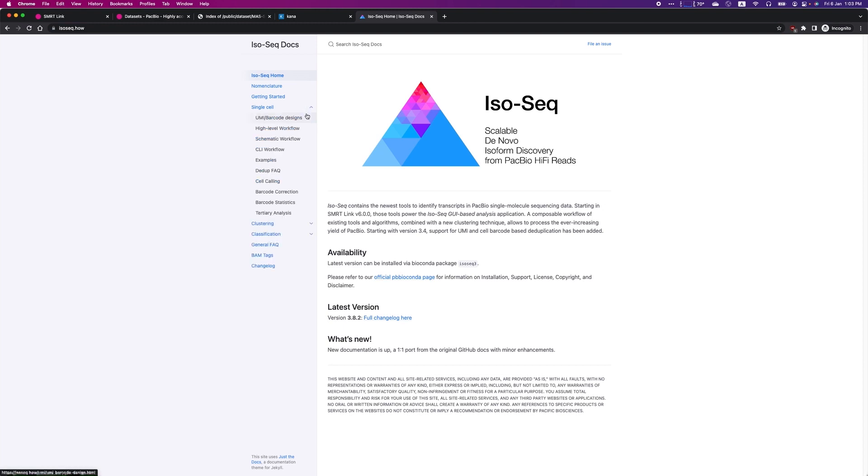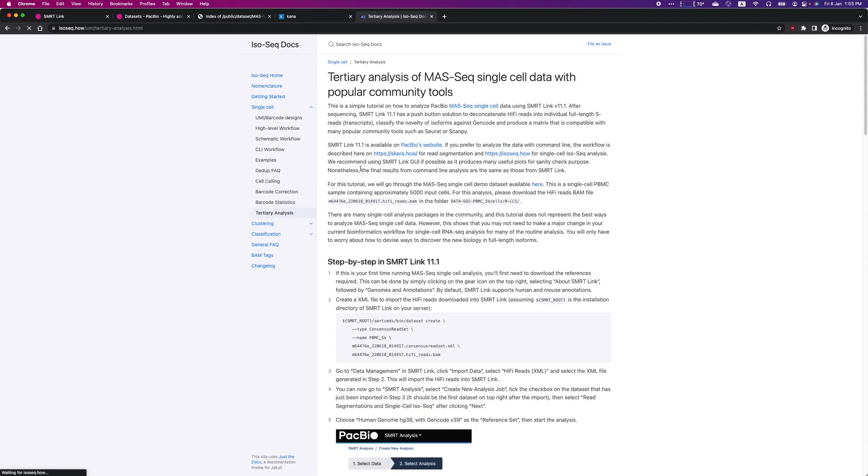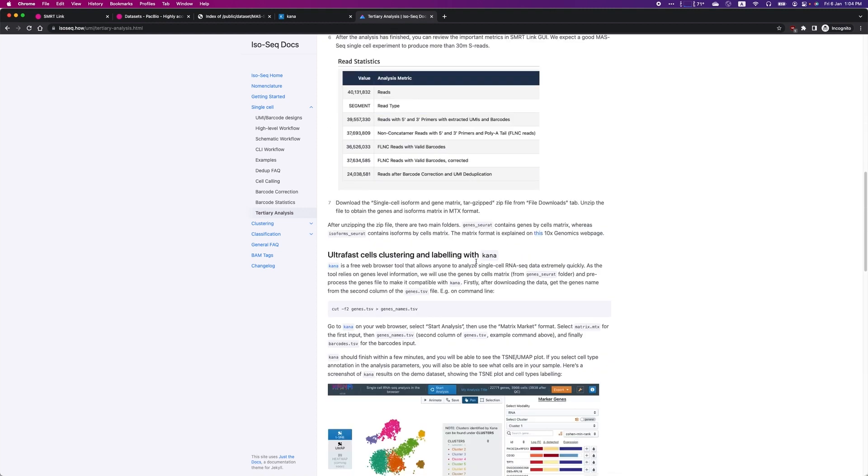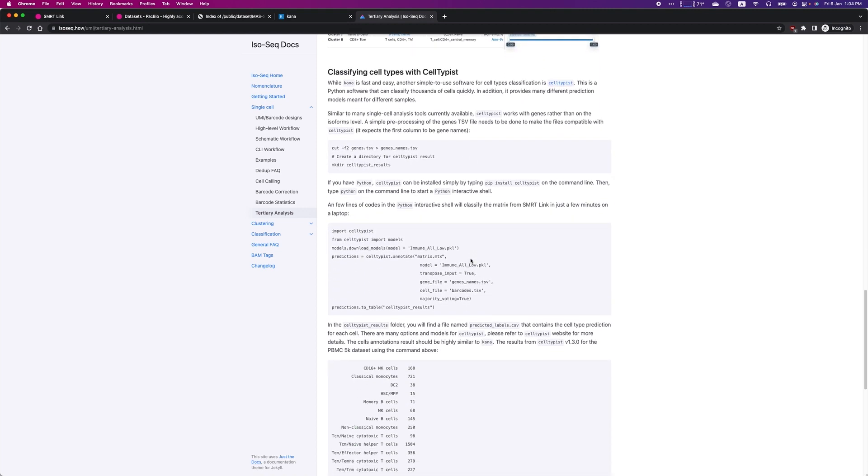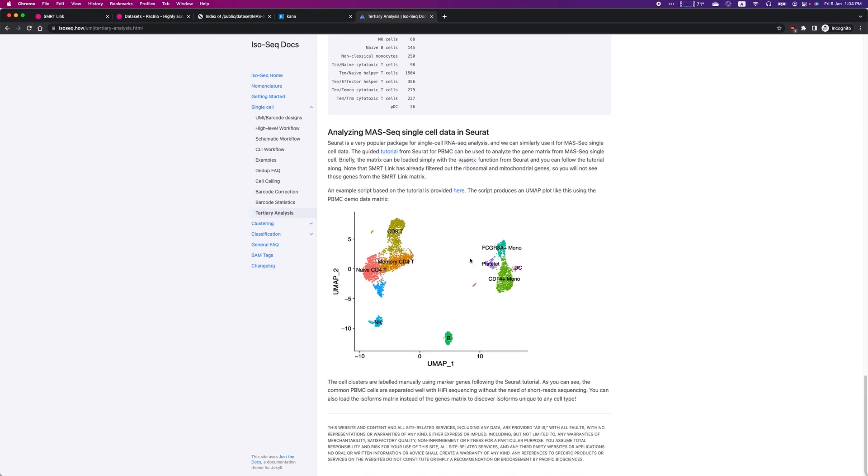On the single-cell page, for example, you will find the instructions of what we have just done with the PBMC dataset. There is also an example script here to process the data using Seurat, and it will generate a UMAP plot for you using the demo PBMC dataset, as shown here.